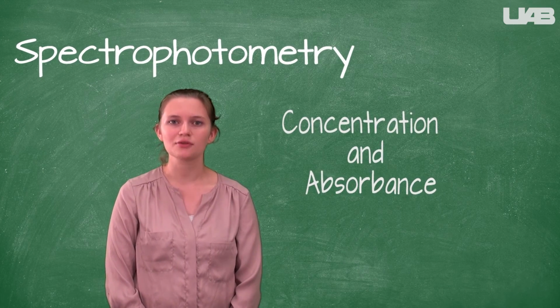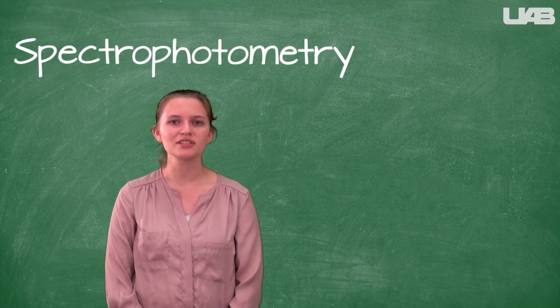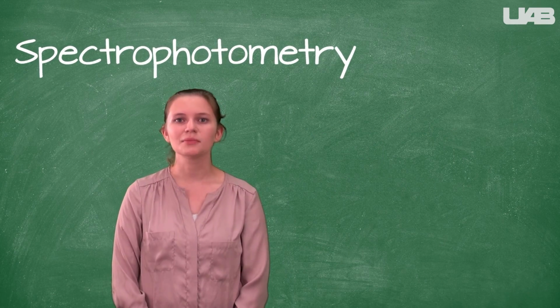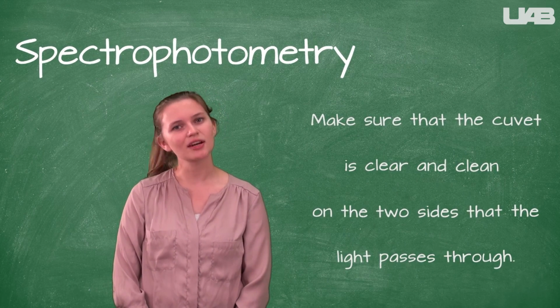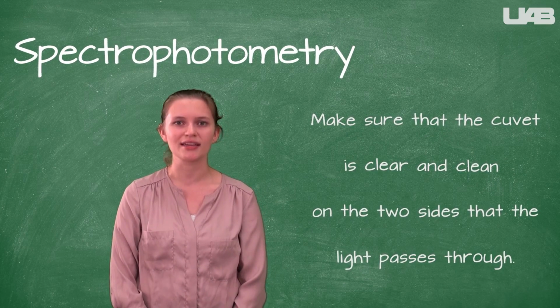Because sometimes a few of the dilutions may look the same, you should come up with a system to label which solution is which without writing anything on the cuvettes. Because we are shooting the light into one side of the cuvette and out through another, you really only need to ensure that the cuvette is clear and clean on the 2 sides that the light goes through.